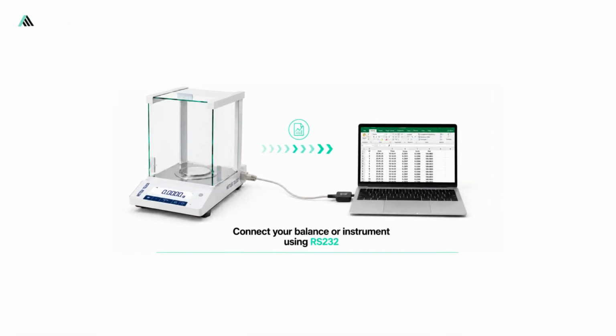Connect your balance or instrument to your computer using its RS232 connection. If needed, use a USB to serial cable. Make sure the instrument is powered on and ready to send readings.